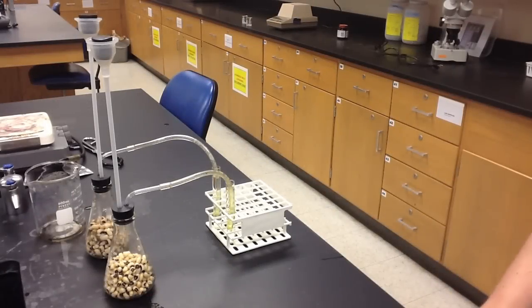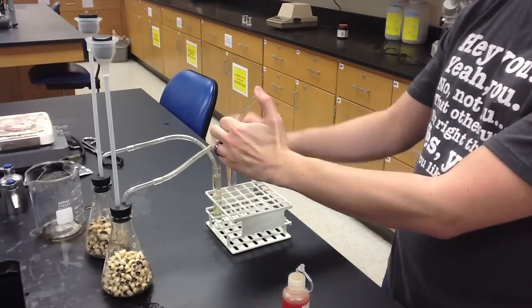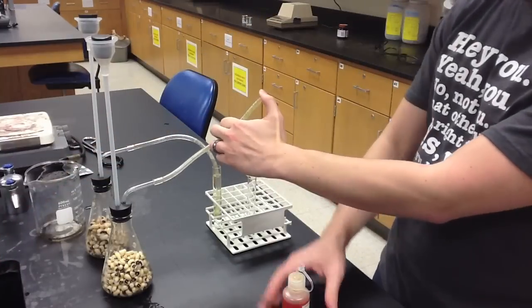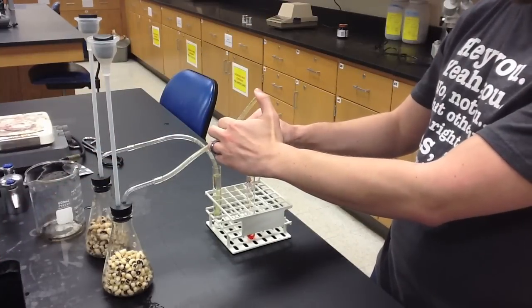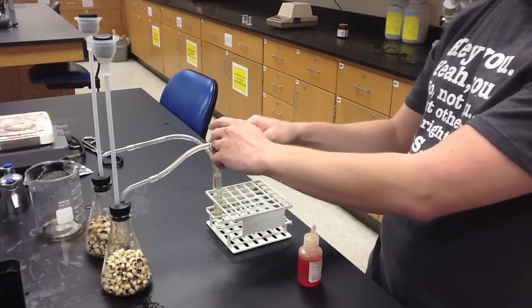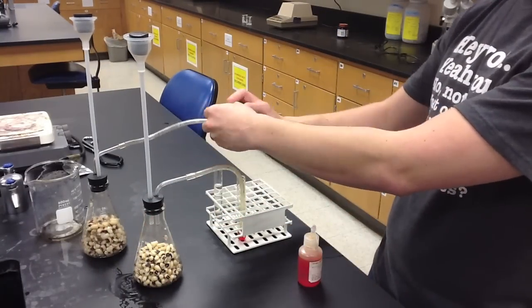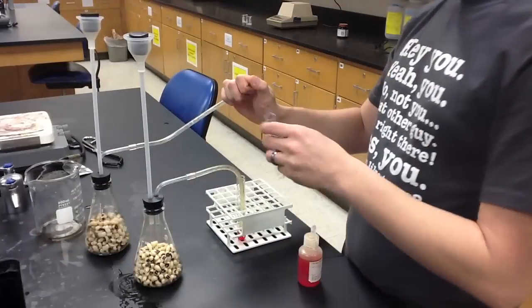At the end of the 40-minute incubation period, we carefully remove the rubber tubing from the test tube, capping it as we do so to maintain the internal environment of the apparatus. We dump the water out and replace it with phenol red, which will allow us to determine if any carbon dioxide was produced in the apparatus.